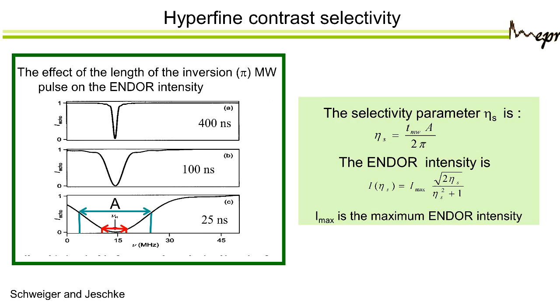And this is in general. Any fancy experiment that you do, immediately you lose quite a bit of sensitivity. So measuring EPR is really very high sensitivity. The minute you go to this type of experiment, DEER, this, you go down considerably in sensitivity. As I said, if the pulses are not selective, we don't see the ENDOR effect. So this is called the hyperfine contrast selectivity.